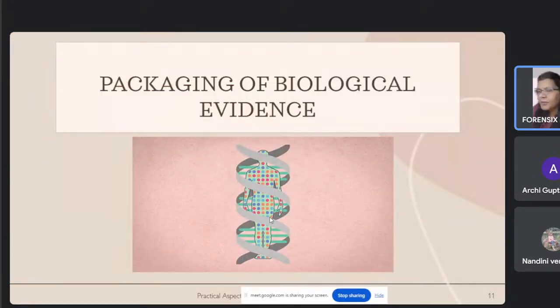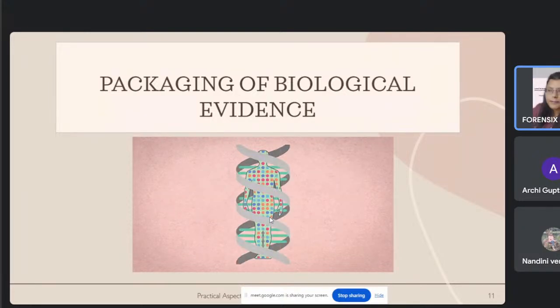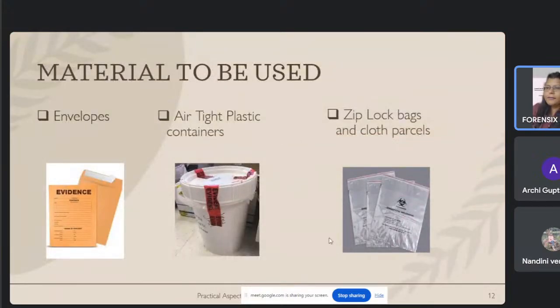How do we package it? We have collected the evidences. We have air dried it. Now our next aim is to send it safely to the lab for the proper analysis. So we use this kind of paper envelope which has all the details of the case. What are the contents of that envelope? What are the details? What is the nature of the evidences? How are you packaging it?